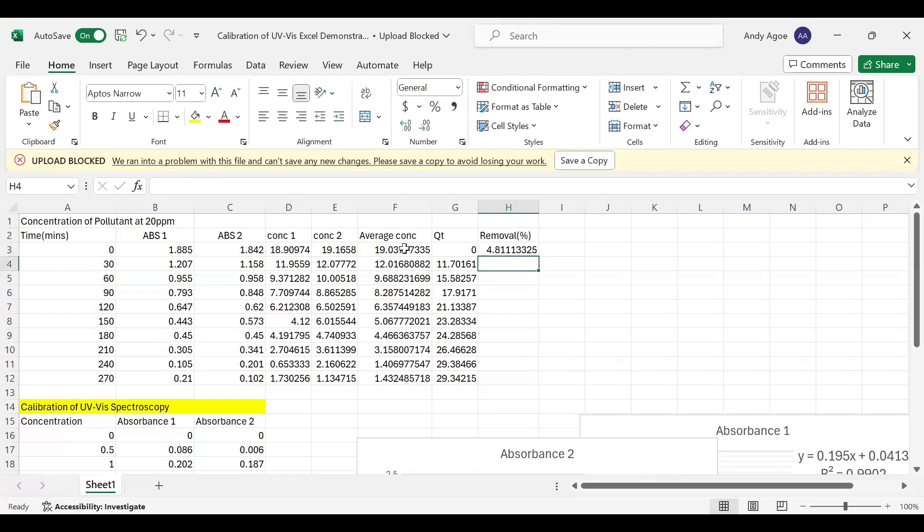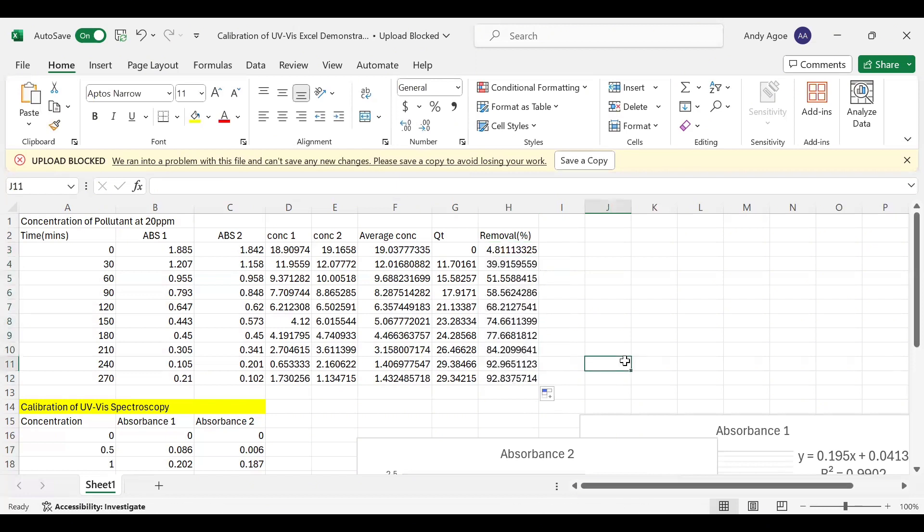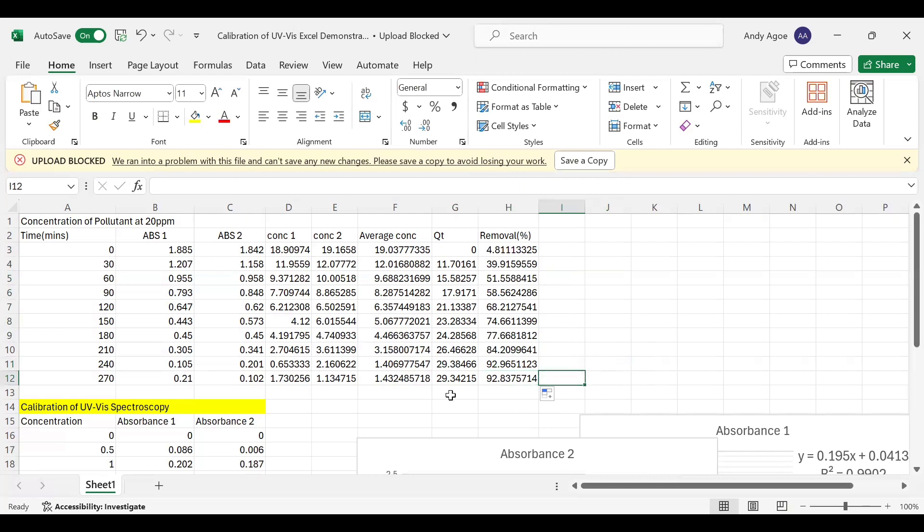Since I'm using the value 20, we do not need to bring any dollar sign. We need to autofill. And once we autofill, we have this. So our percentage removal is 92.8, which is approximately 93%.